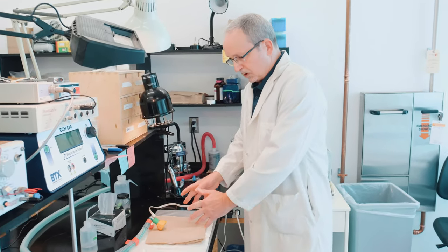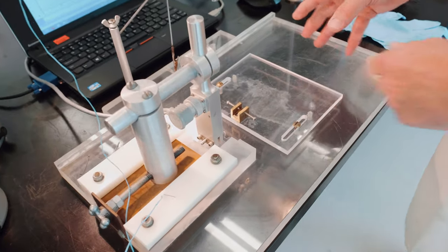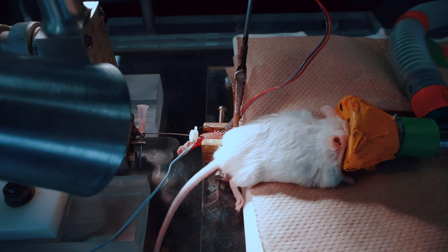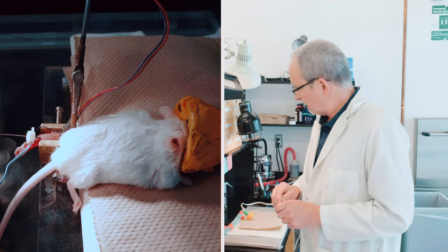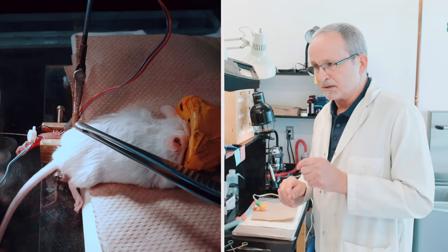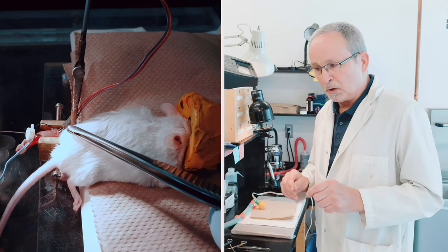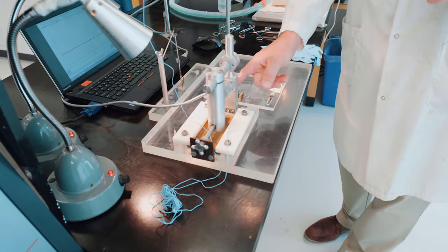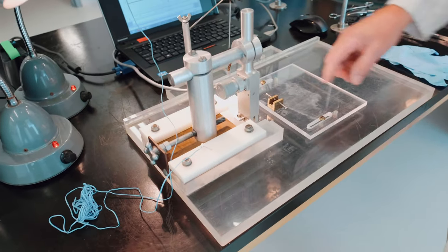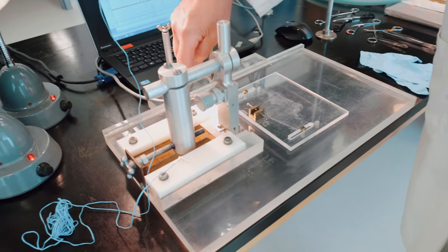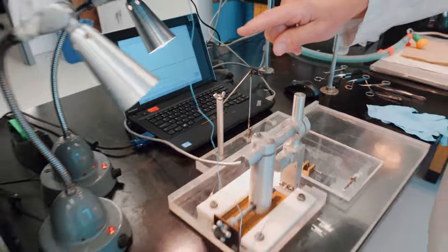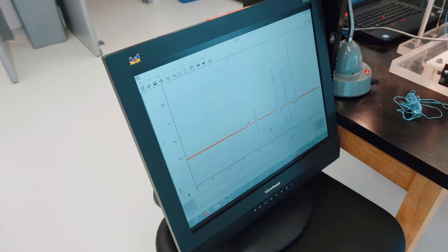Once the animal is prepared I'm going to move him over to this platform, where he'll still be anesthetized. The muscle will be attached to this set of instruments, and the entire preparation is called the in situ hind limb muscle preparation — called that because the muscle is actually in the same situation it normally is. It's still in the animal, still gets its own blood flow. The animal is just asleep and perfusing the muscle like it normally would. The muscle will be connected to this instrument called a force transducer, which transduces the mechanical signal of the muscle into an electrical one that we can visualize on the computer screen.